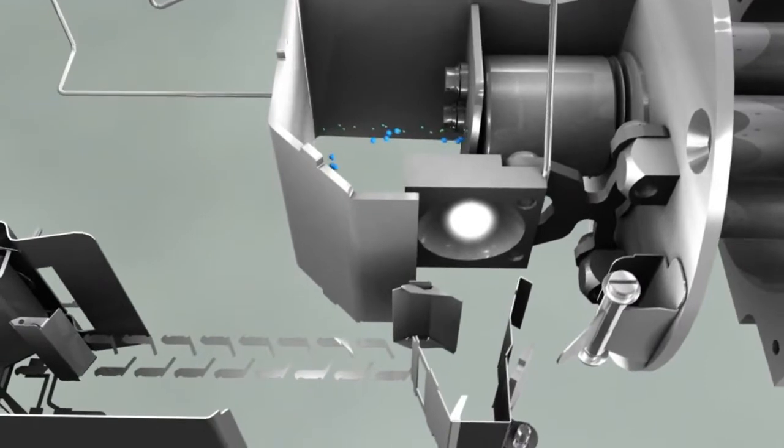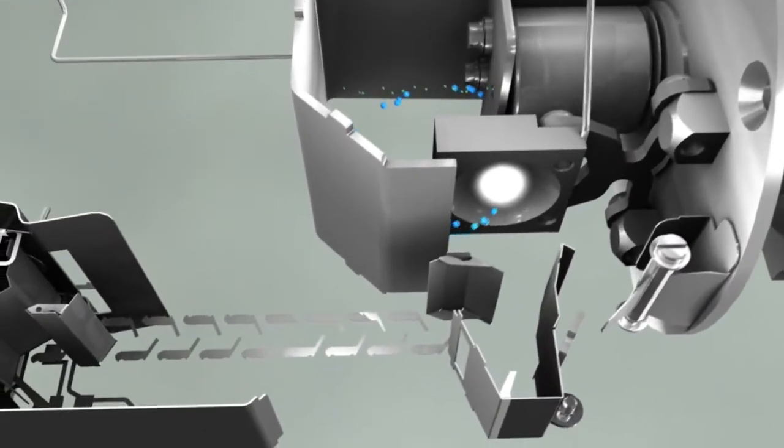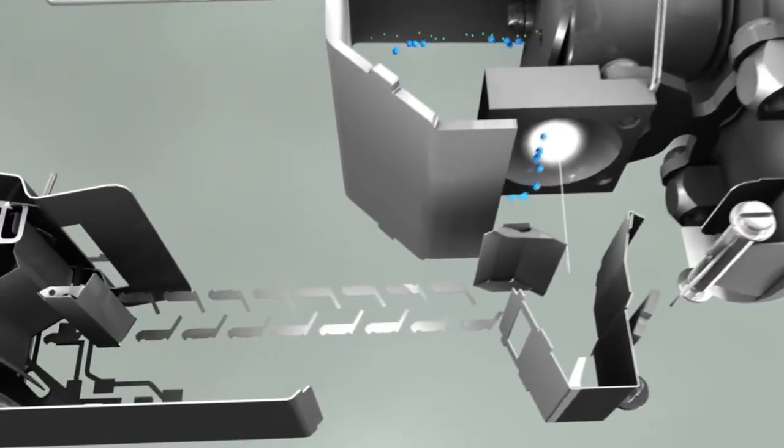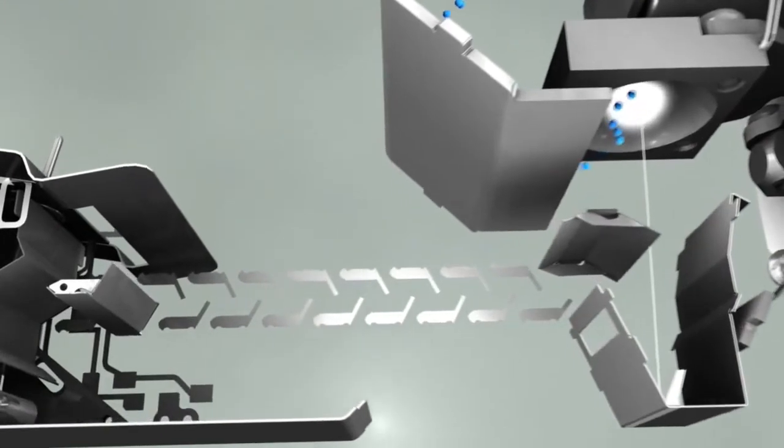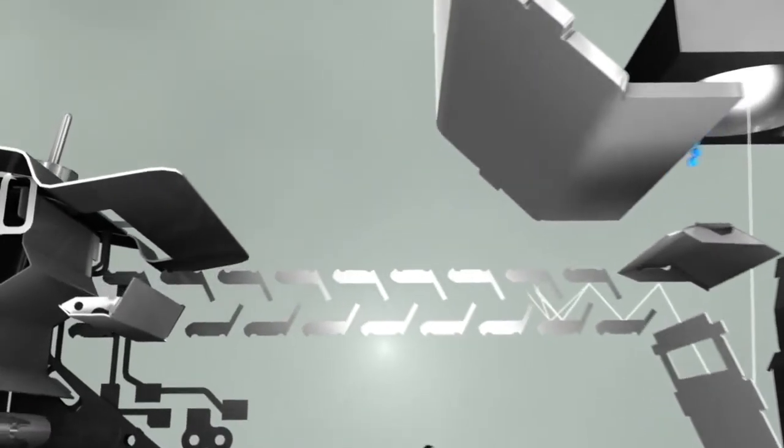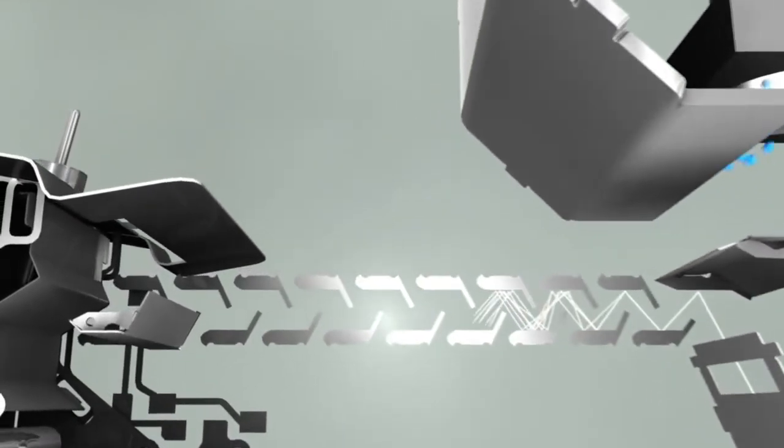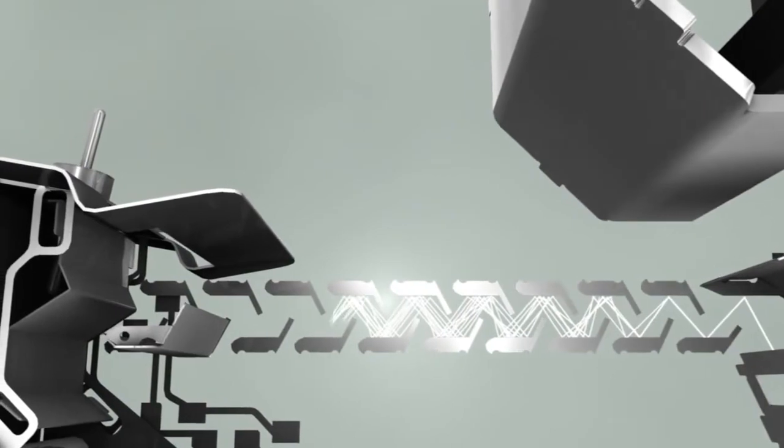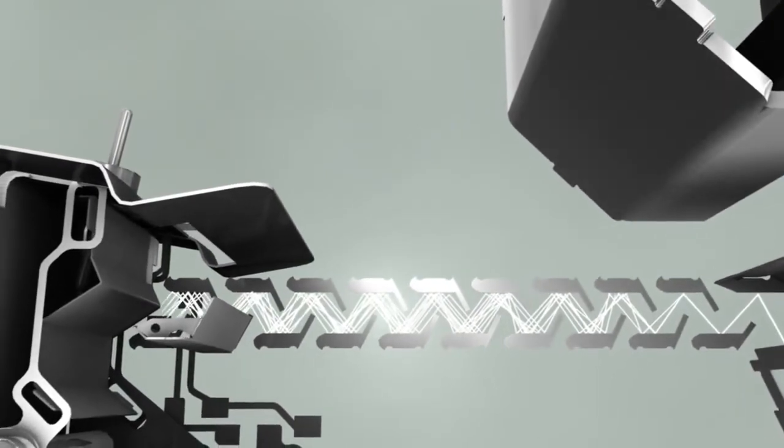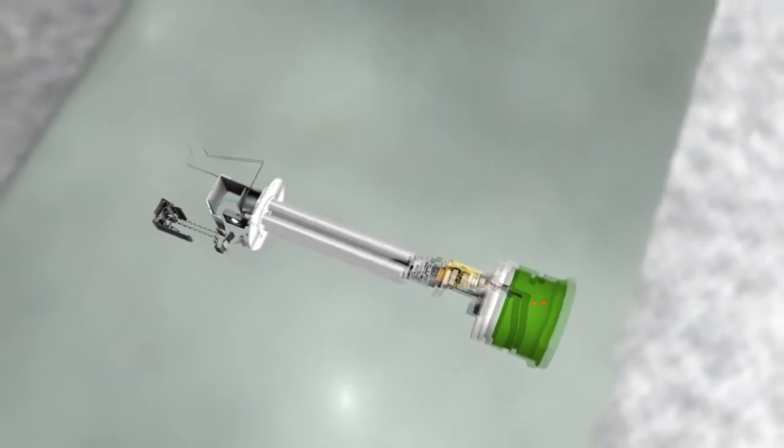A high-voltage conversion dynode delivers a stream of electrons to the most extensive array of dynodes ever engineered into a GC-MS detector. CLARIFY's extensive, discreet dynode design results in a never-before-seen level of long-term performance and sensitivity.